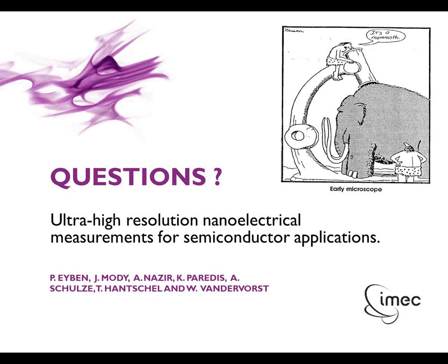Yeah, there's another question here on the system in the glove box. You mentioned a lot of very nice examples on using the SSRM and also conductive AFM modes. What other electrical modes can you actually run on that system in the glove box?